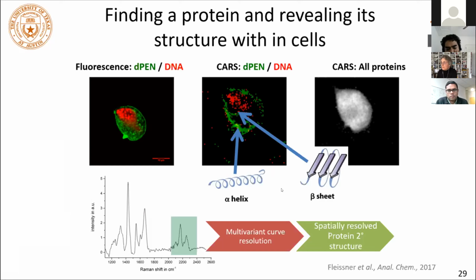Good question. I would say the answer is, I don't know right now, but I think it's plausible. The way that I did everything here was in transmission. We've done stuff in 3D hydrogels. That works okay because it's still transparent. The organoid is possibly not transparent because it's so dense, right? You can do this in a reflection or epi-direction, but the signal is often extremely weak unless you're doing it in an animal where you have tons of backscattering. Depending on the amount of backscattering, you might be able to produce the information, but it's going to be a question of how long you want to wait for it.